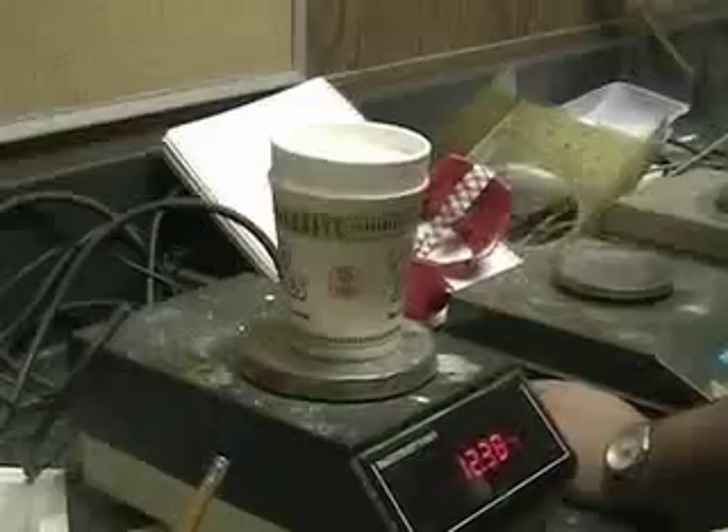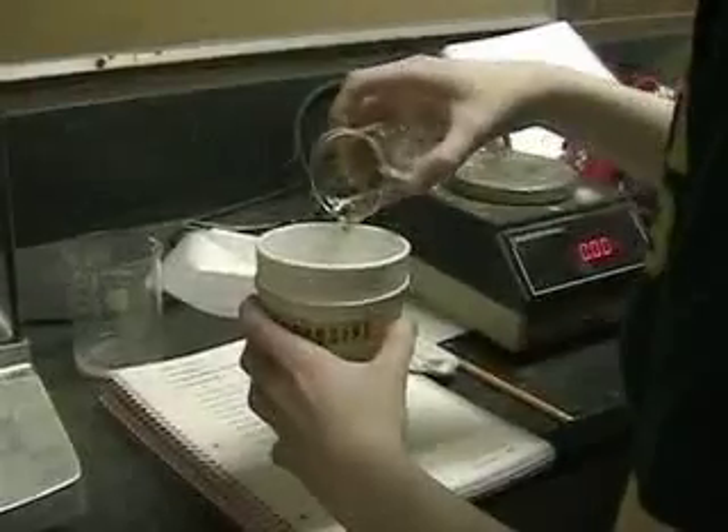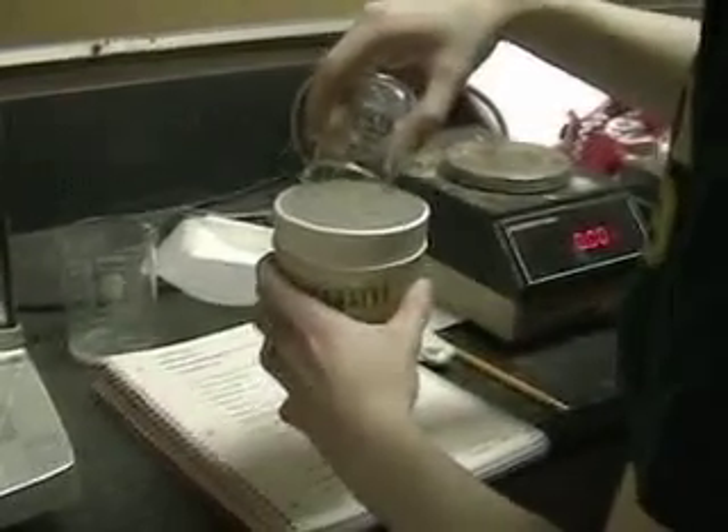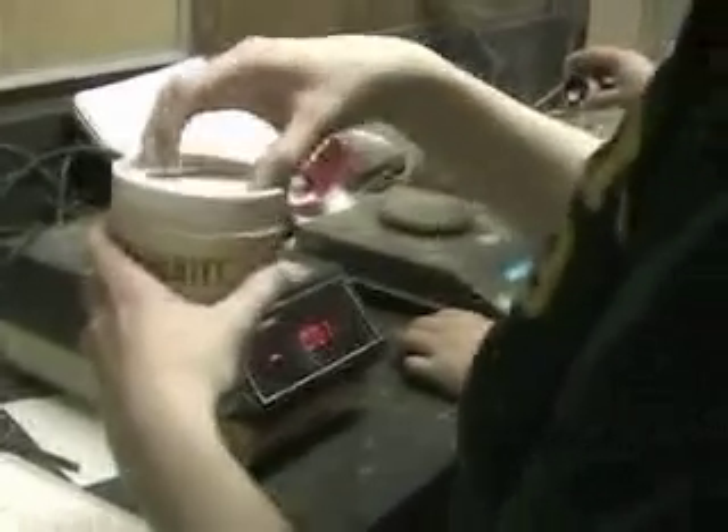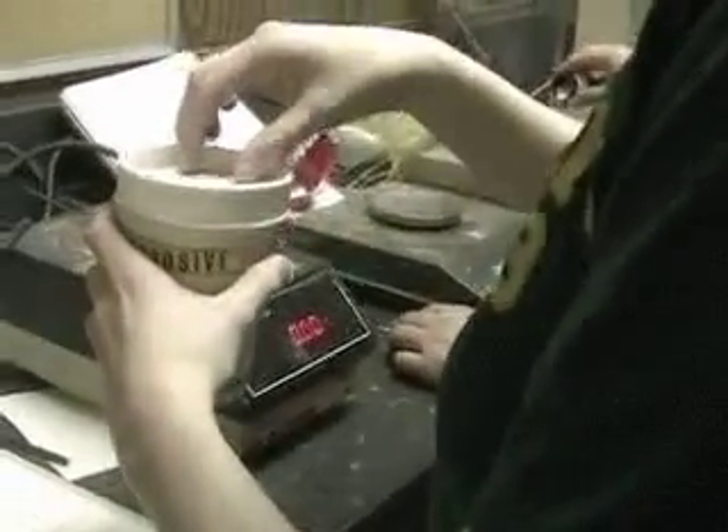We set up the calorimeter by pouring water into it. We need to know the mass of the water that's in the calorimeter, so we weigh the calorimeter empty. We put the cool water into the calorimeter, and then find the mass of the calorimeter with the water in it. We can find the mass of the water by subtracting the mass of the empty calorimeter.